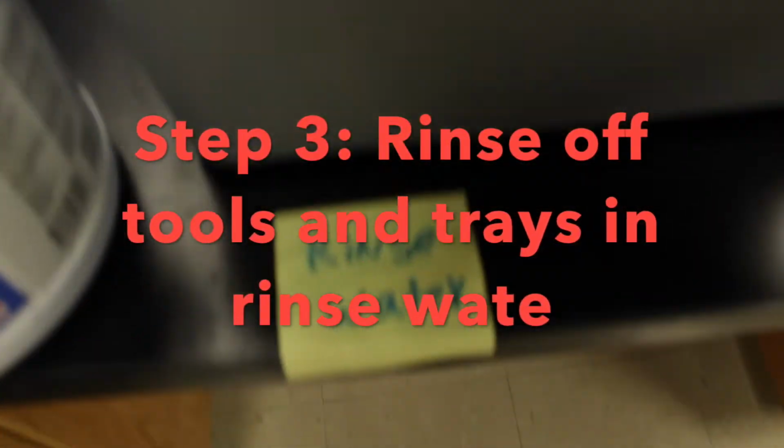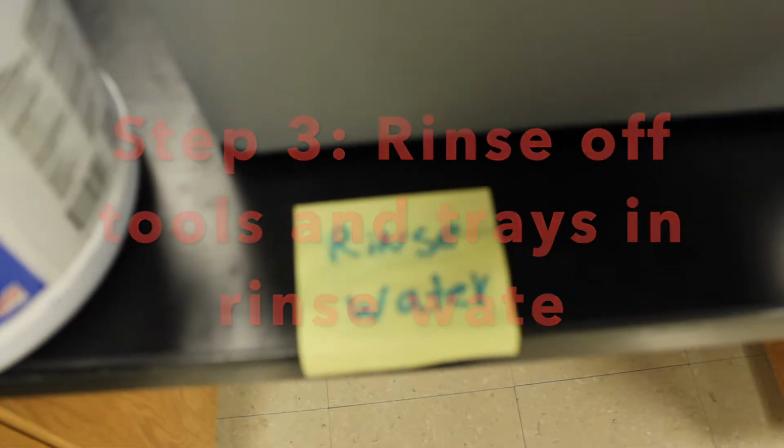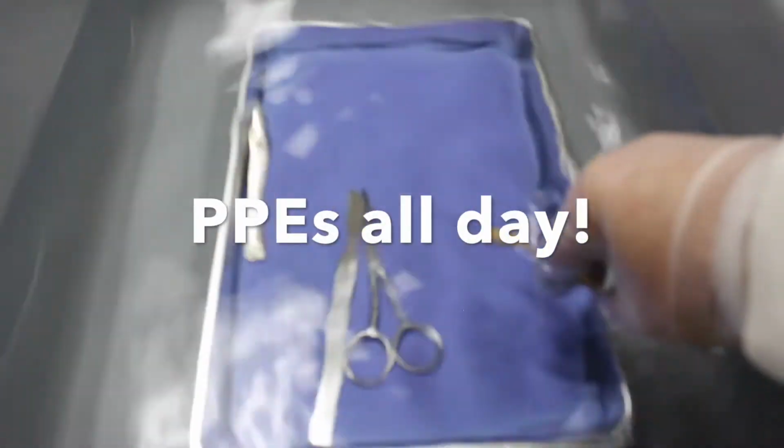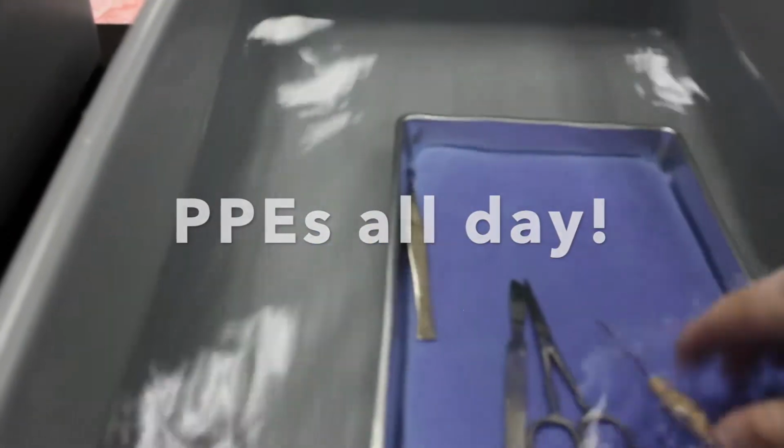We're going to take it through the regular water. So regular water or rinse water is right here. So this one has bleach. Look at that, totally awesome bleach. That we don't want on our skin, so we have to have our PPEs, our gloves, to keep our hands safe and our clothes safe. Then we drop it in the rinse water, so we rinse everything.